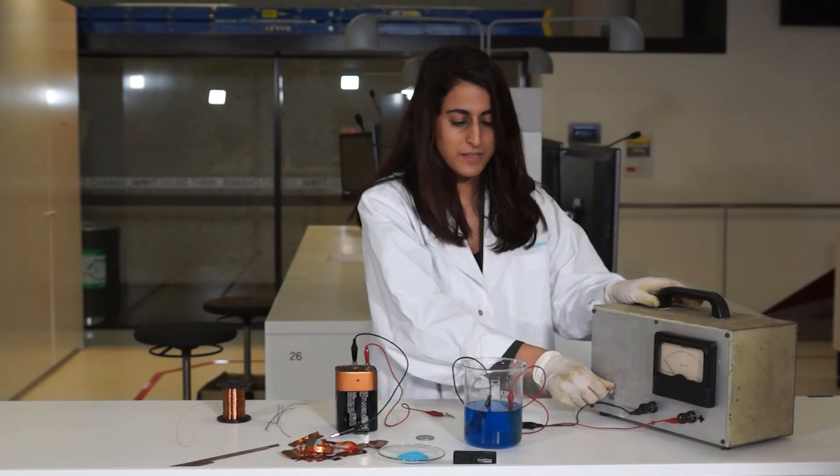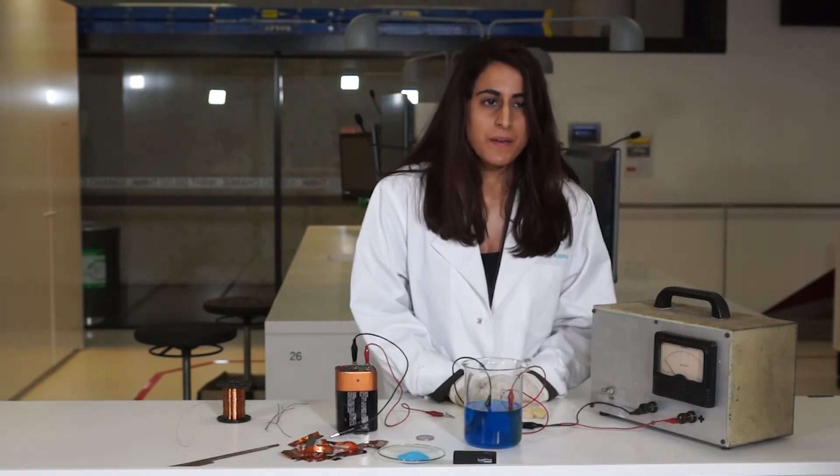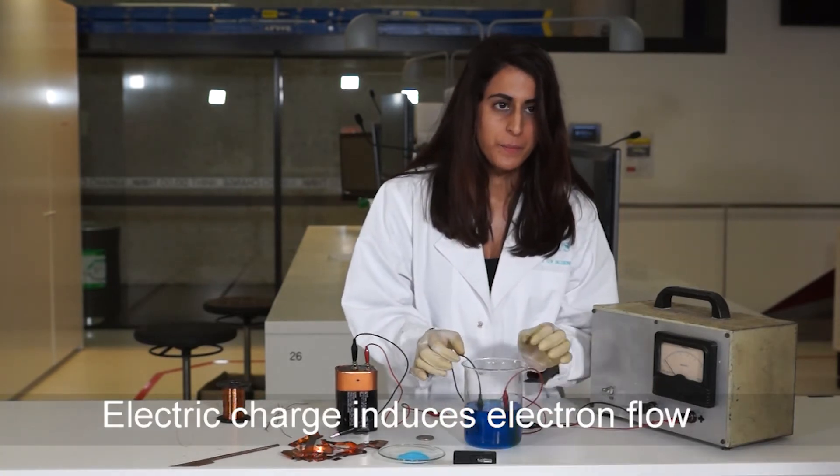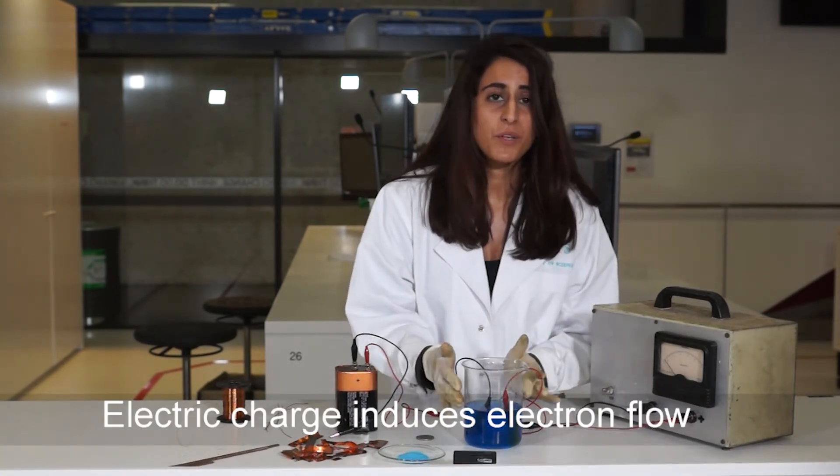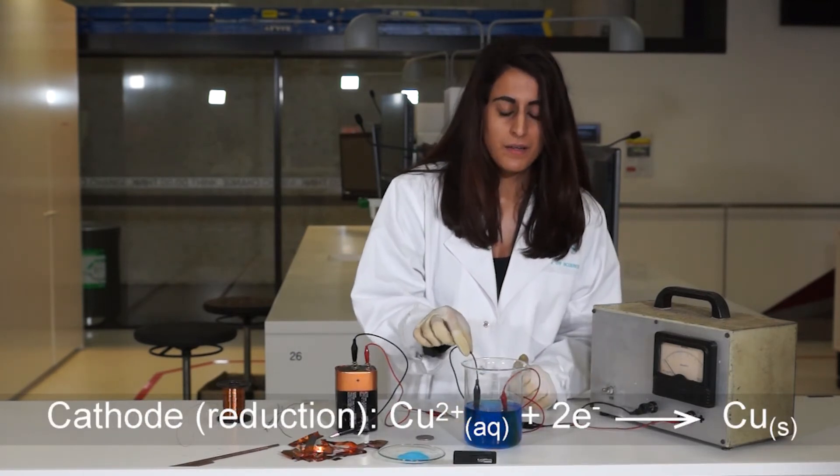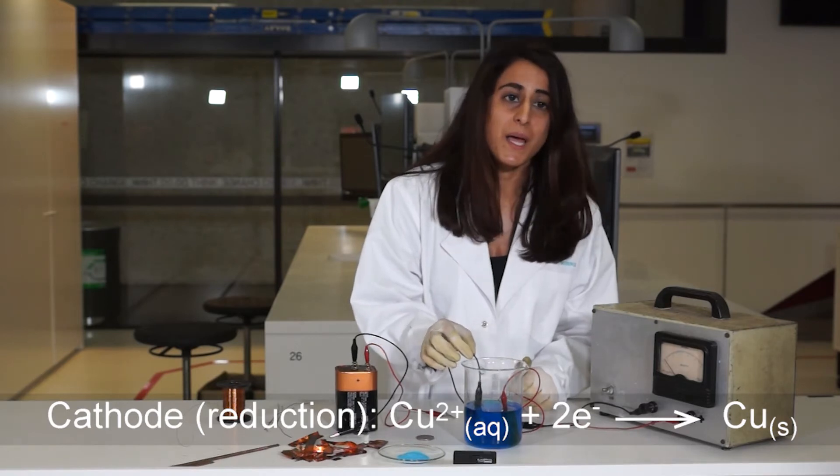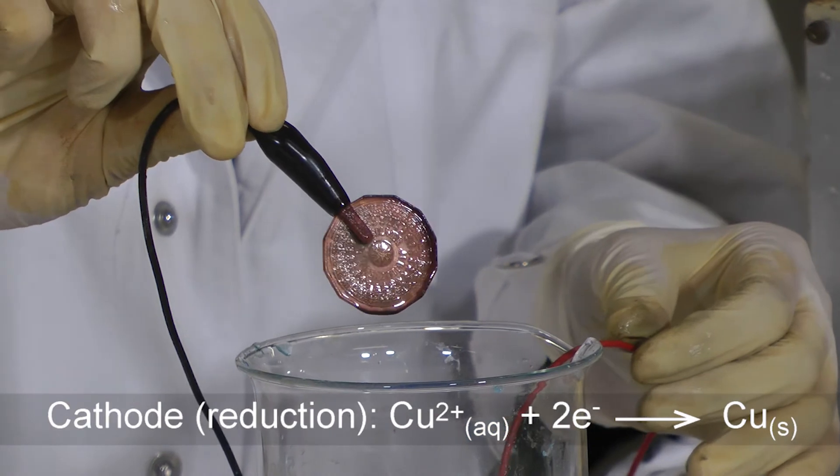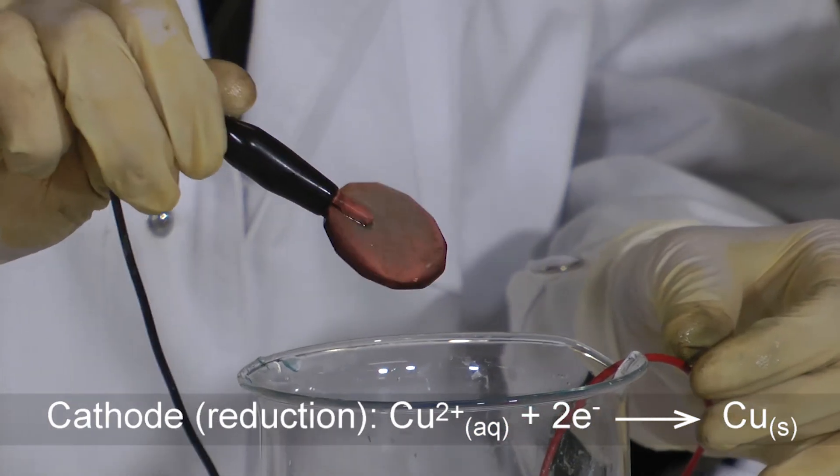I'm turning it on so that our circuit will link it up. And we're going to see the following process: the electrical charge will drive the flow of electrons. Now the positive copper ions in the solution are attracted to the negative cathode. They will accept electrons and become copper metal, and you should be able to see copper metal forming around the coin.